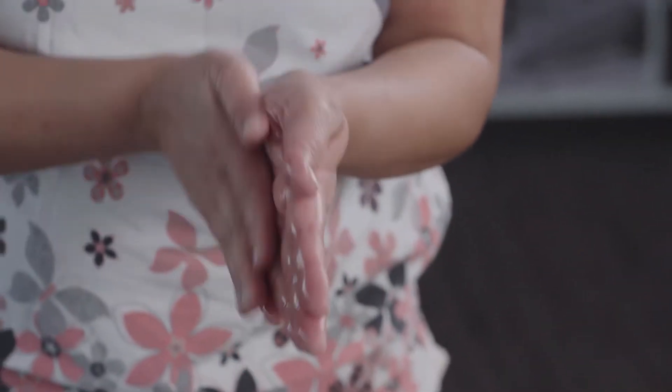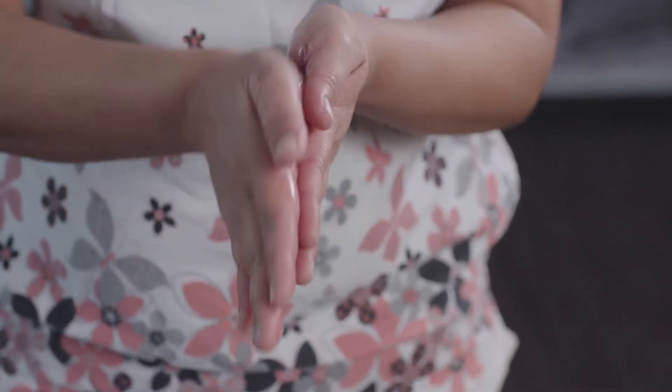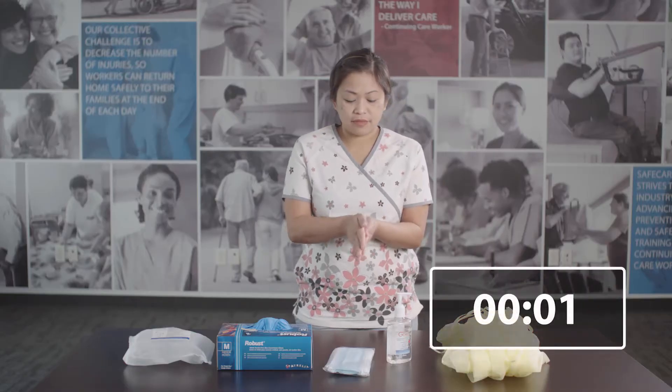First, perform hand hygiene using alcohol-based hand rub or washing your hands with soap and water for at least 20 seconds.